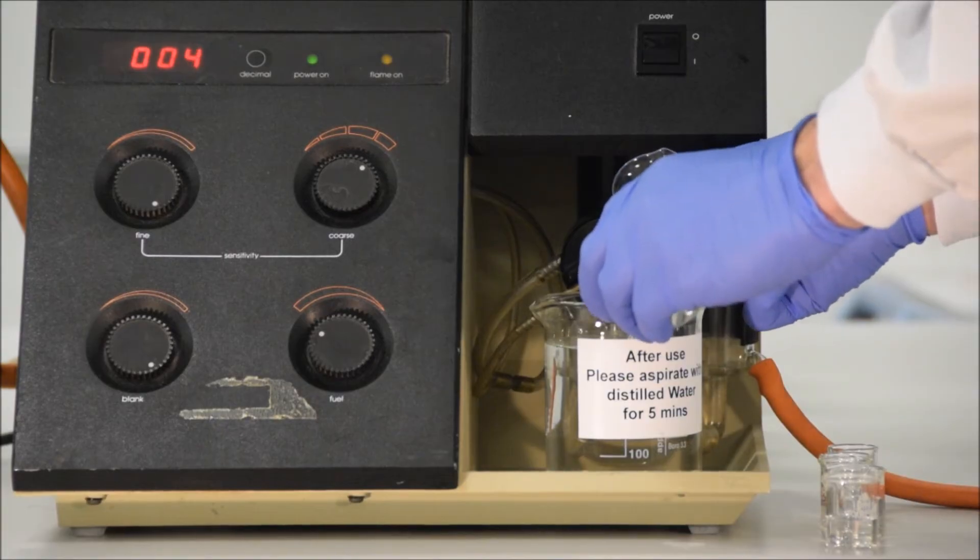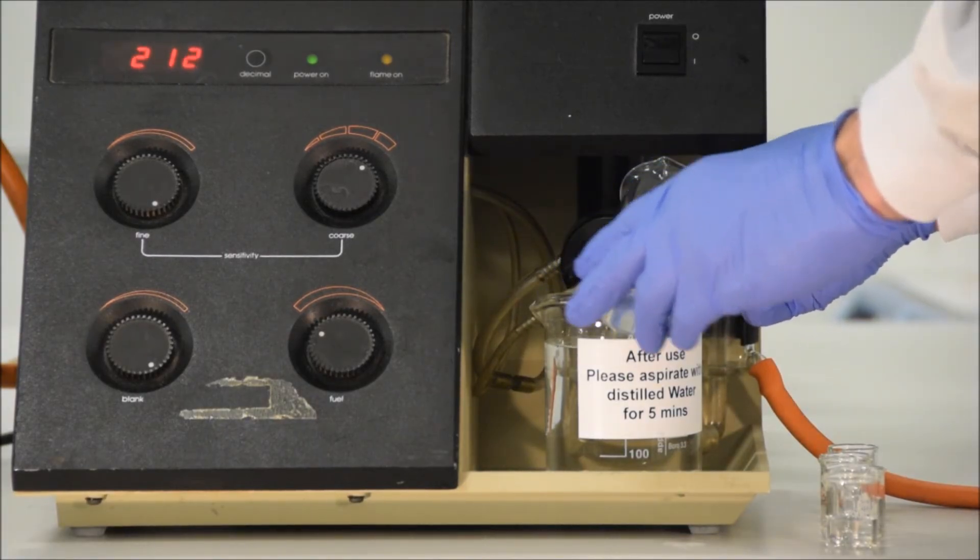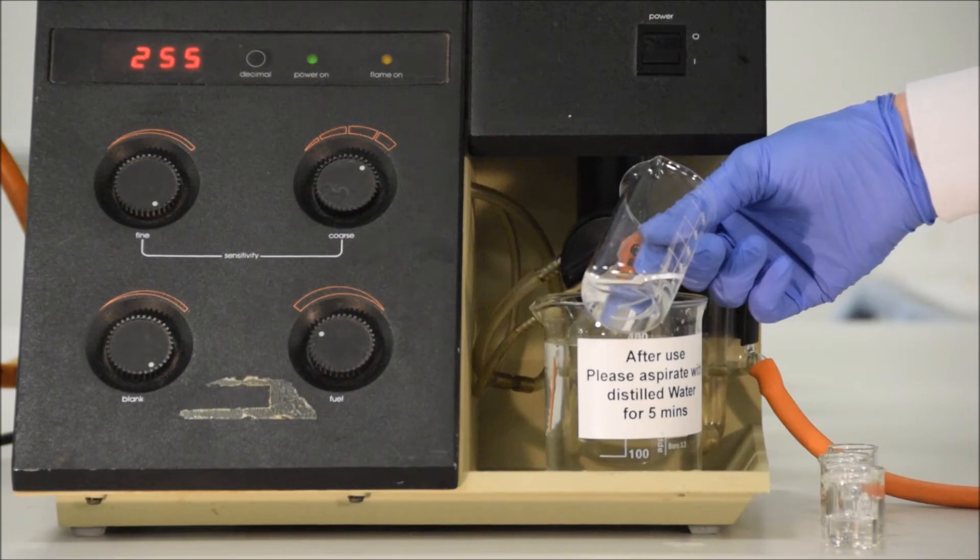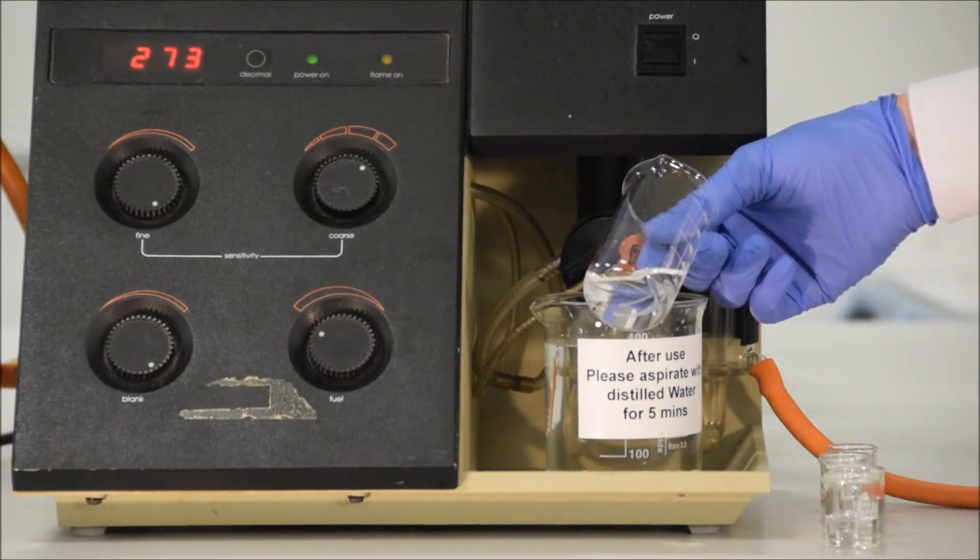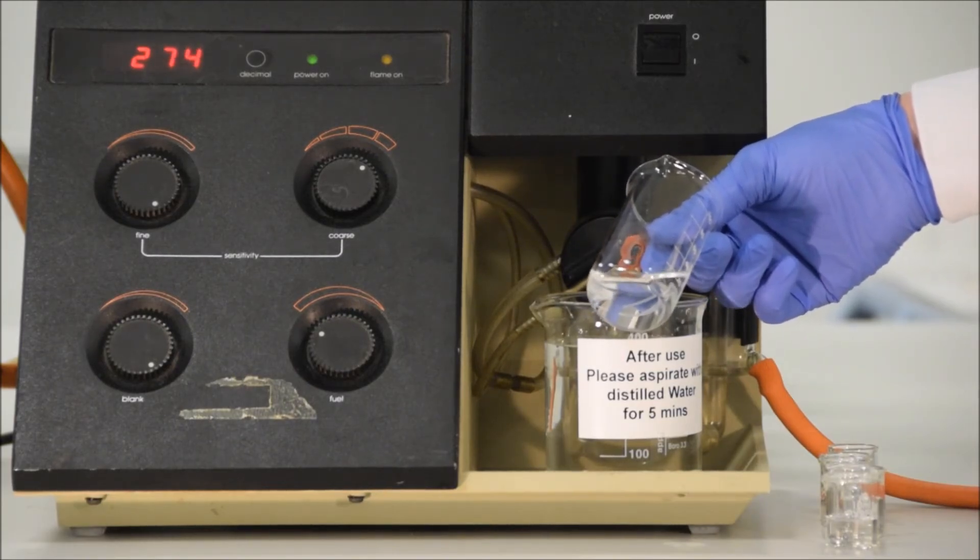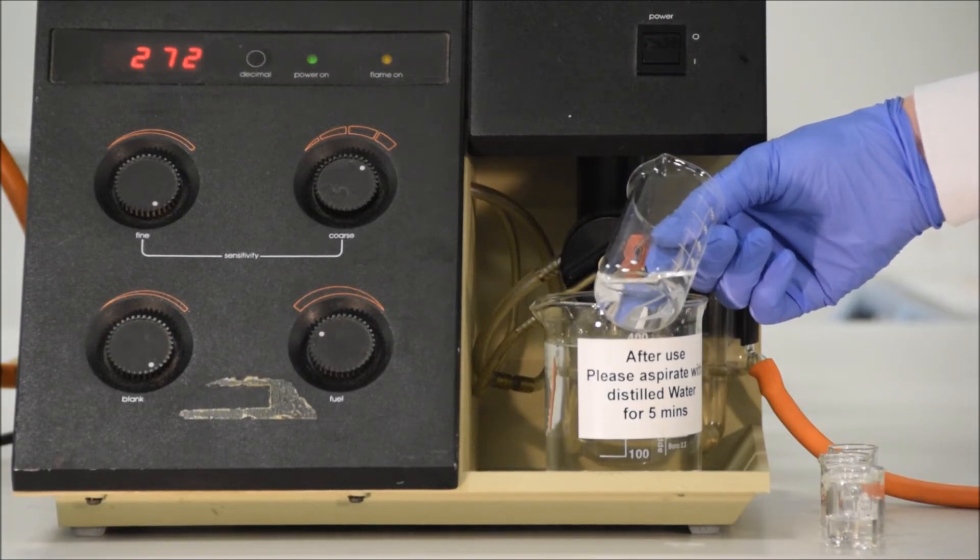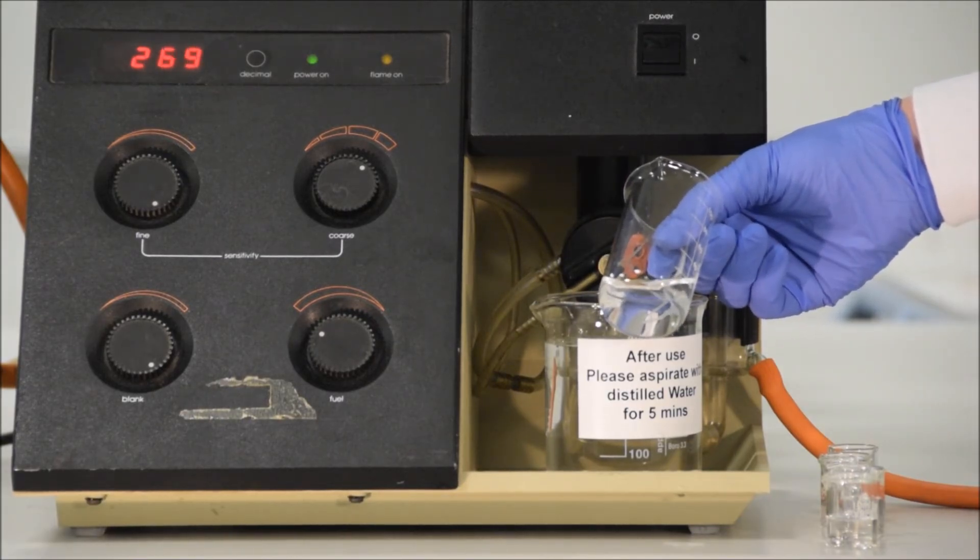Finally then, let's do our unknown sample. We follow exactly the same procedure. Aspirate for 20 to 30 seconds, wait till we have a consistent value, and then record that value. Once we're finished, return the inlet tube to the distilled water, and wait for at least 5 minutes until you turn the machine off.